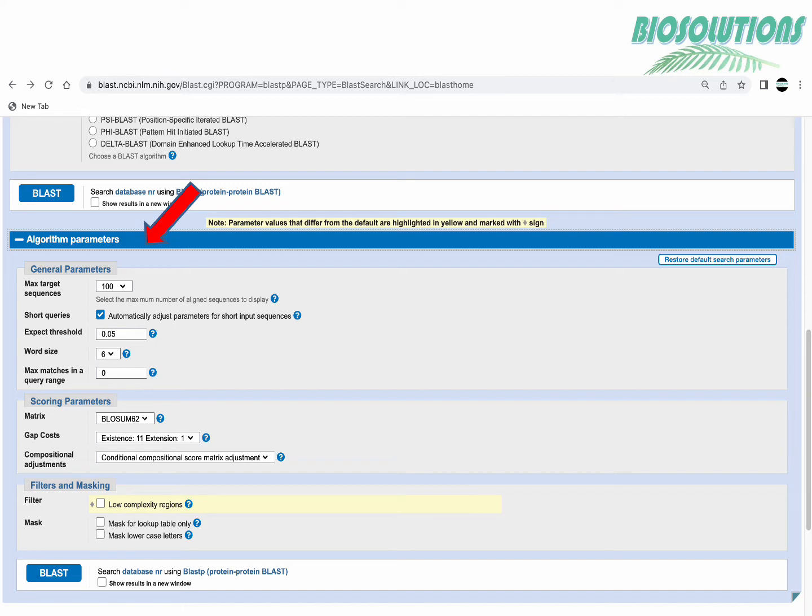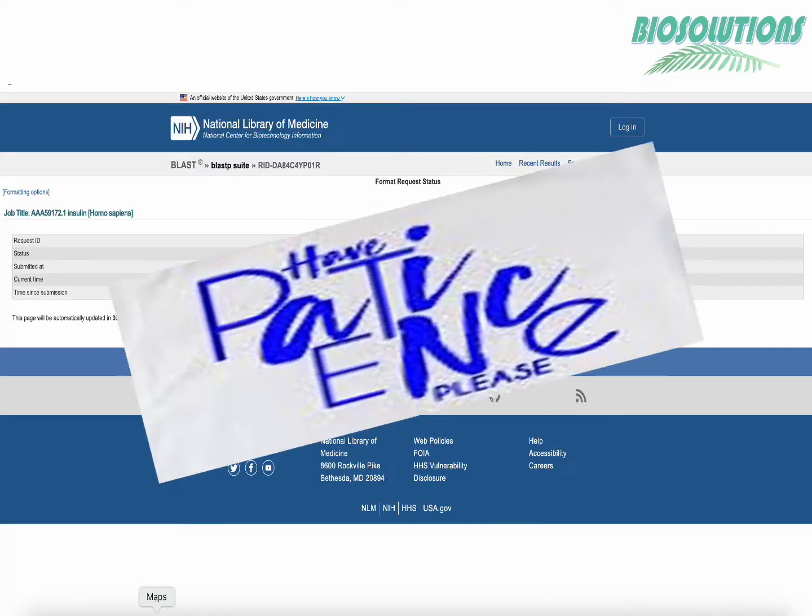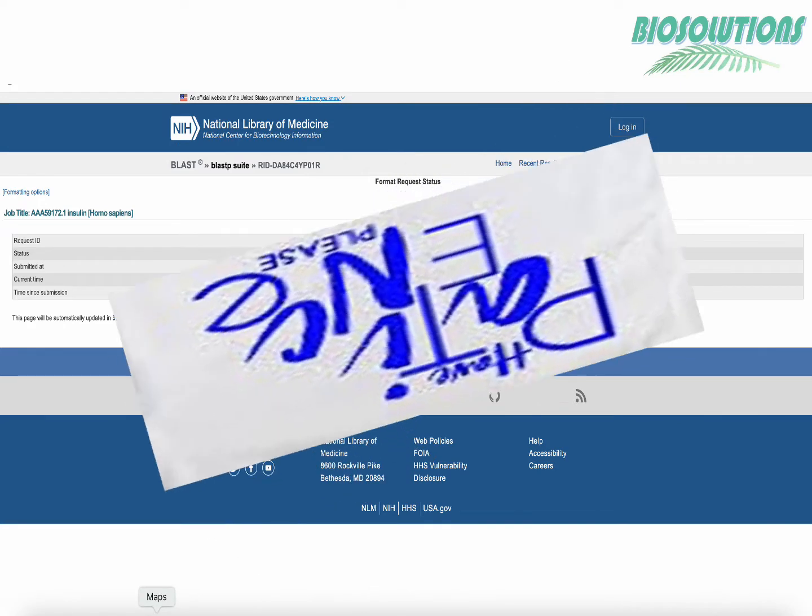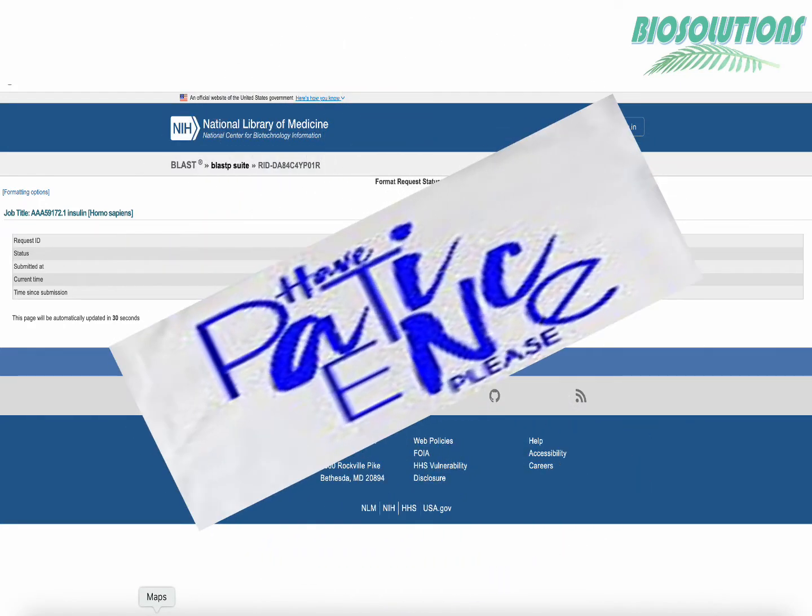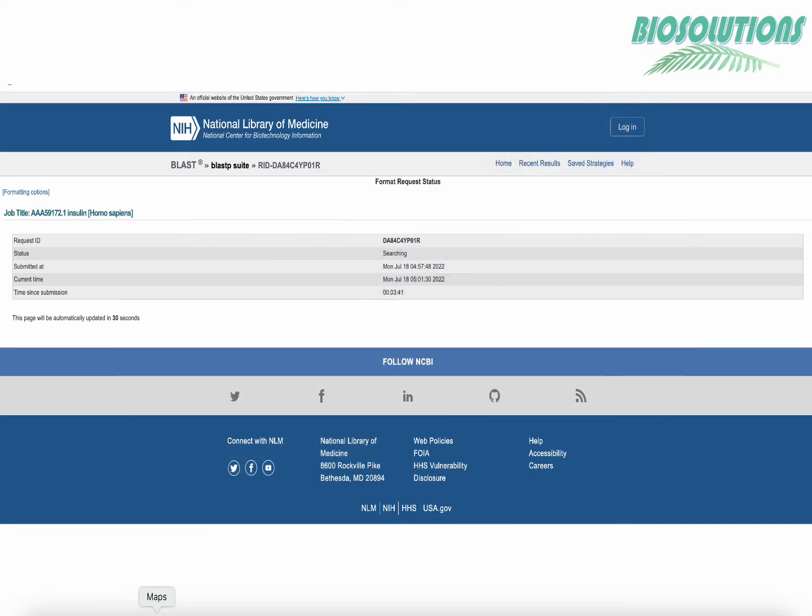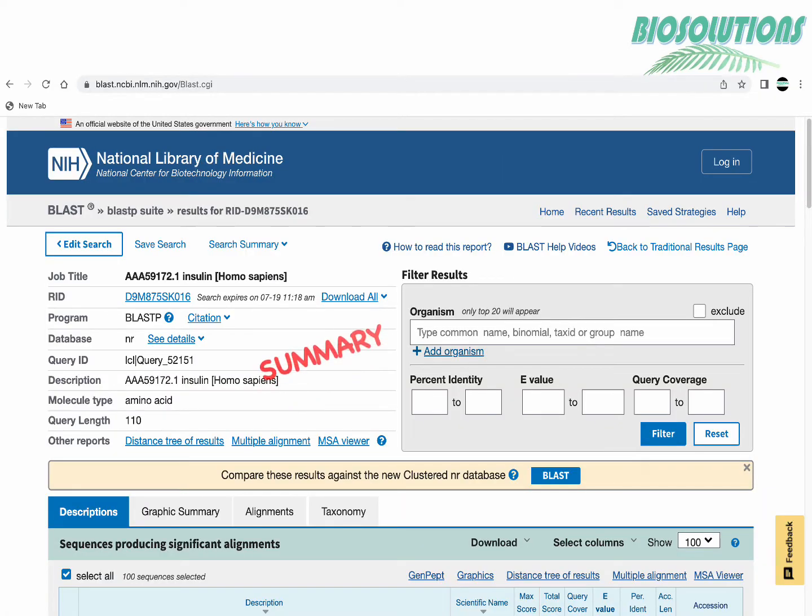Now we hit the BLAST button and it may take few minutes so please be very patient and let's see the results.